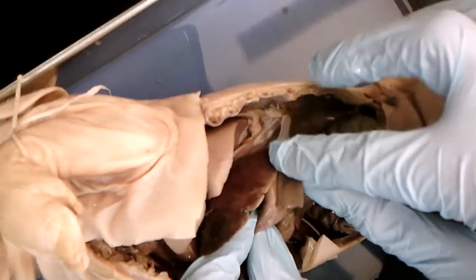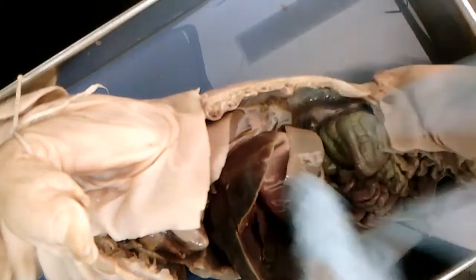So when I was saying be very careful when your students cut, it's so easy to cut some of the organs. And without that tip, that may not give the hint to the student that that's the spleen. Another trick with the spleen is when you touch it, it's very smooth. So just kind of have them touch it. Pet it a little bit, it'll be all right. And it's very smooth.